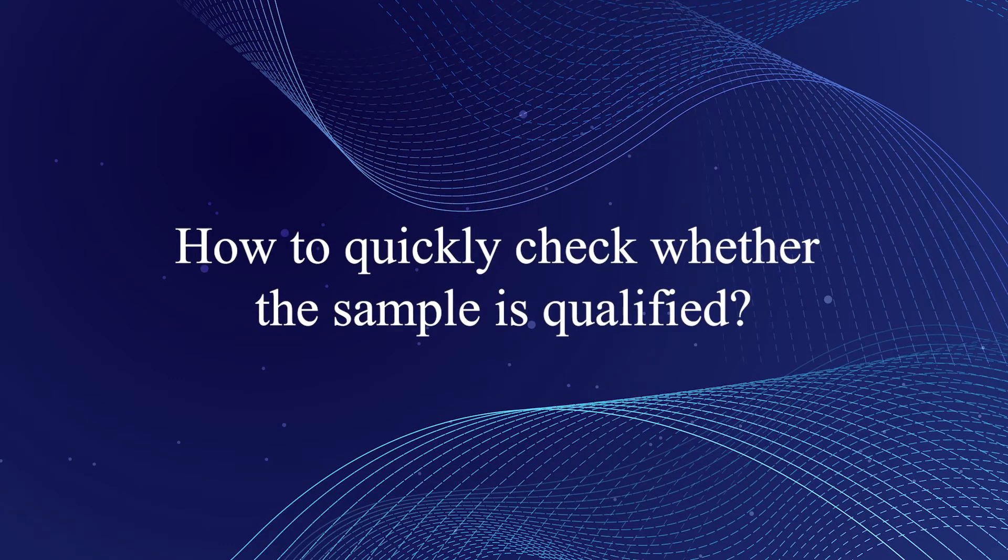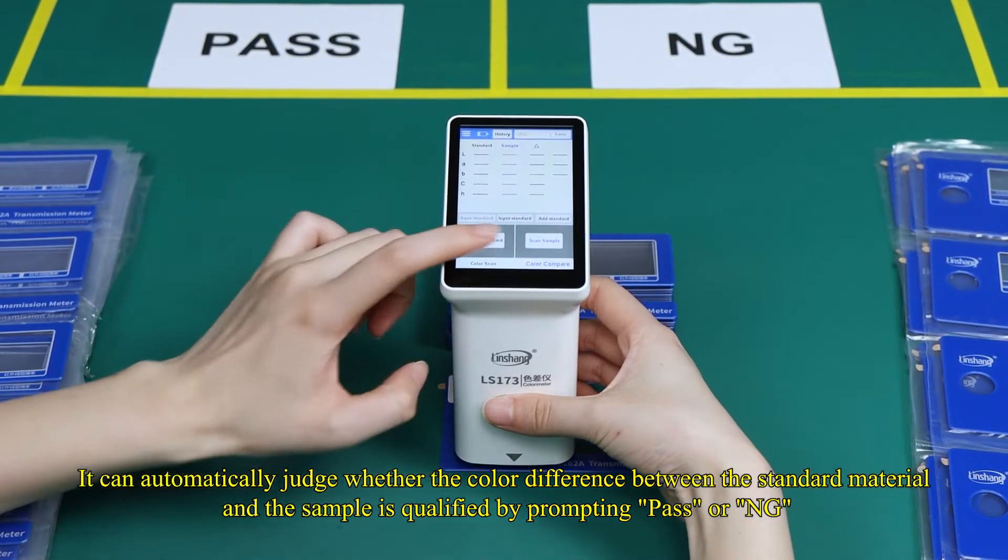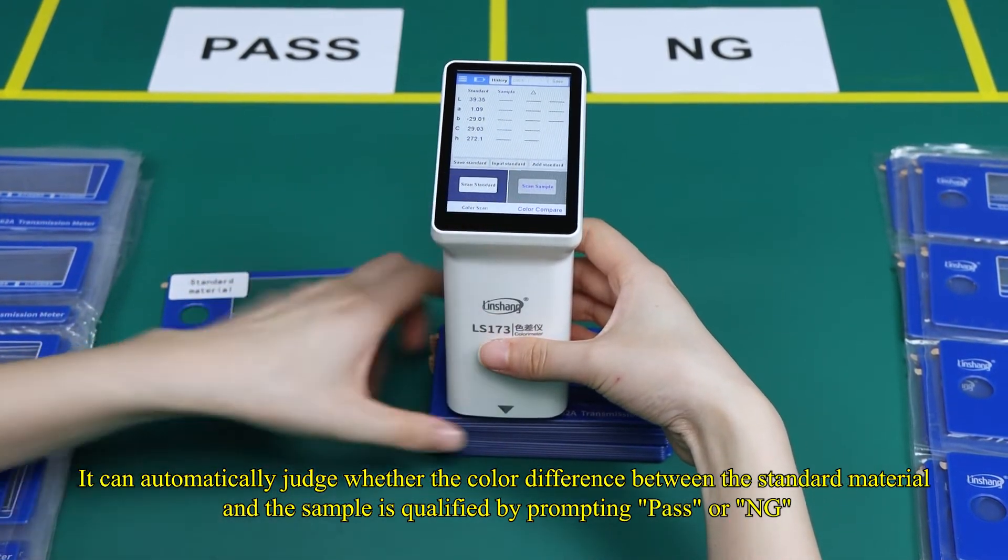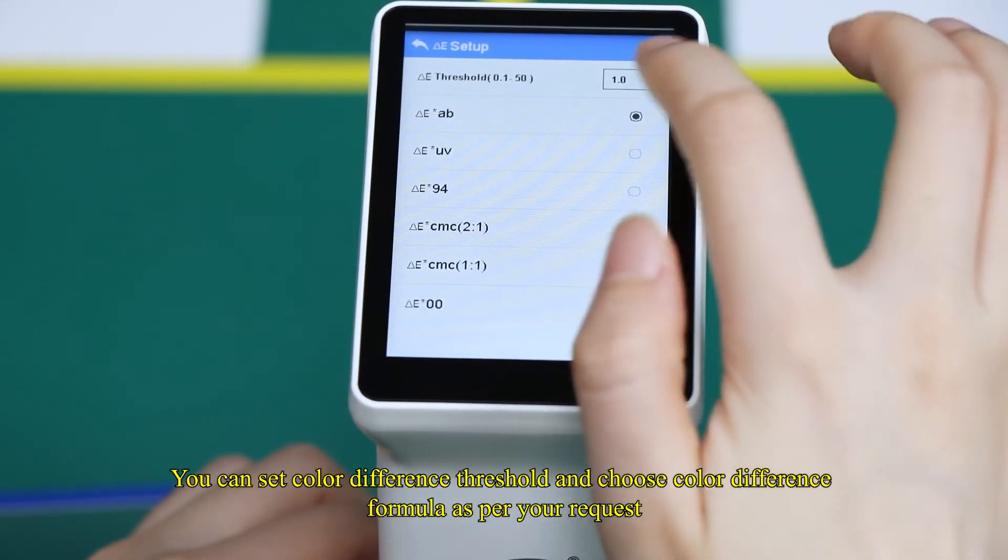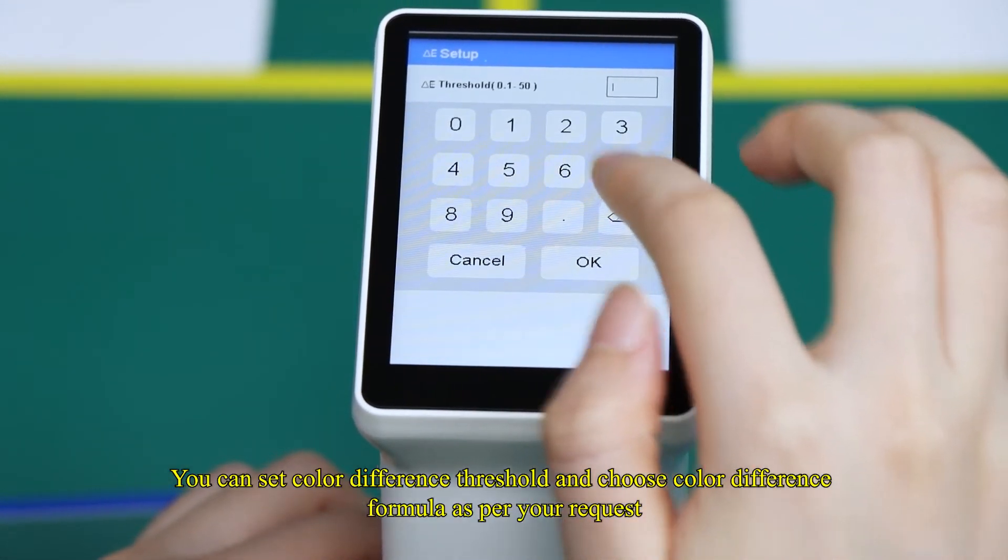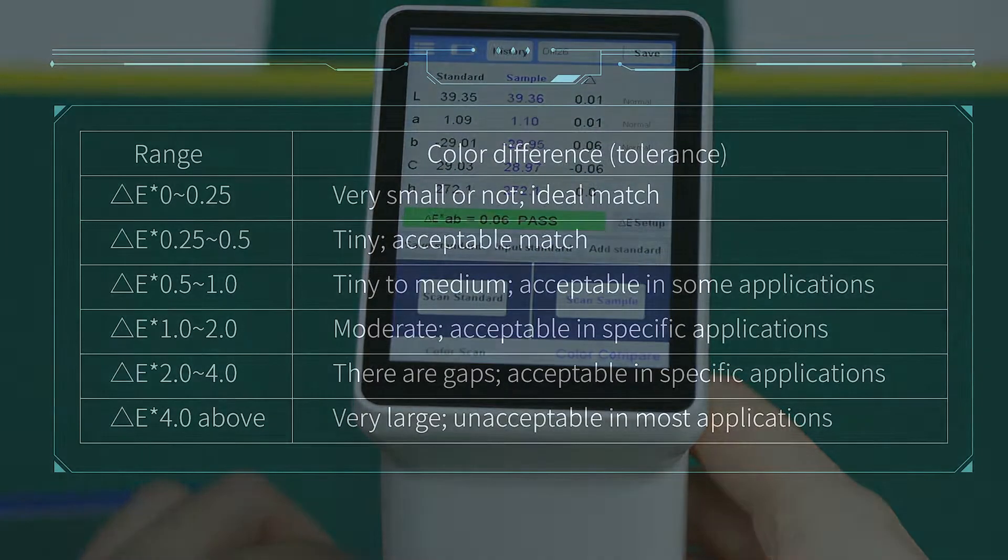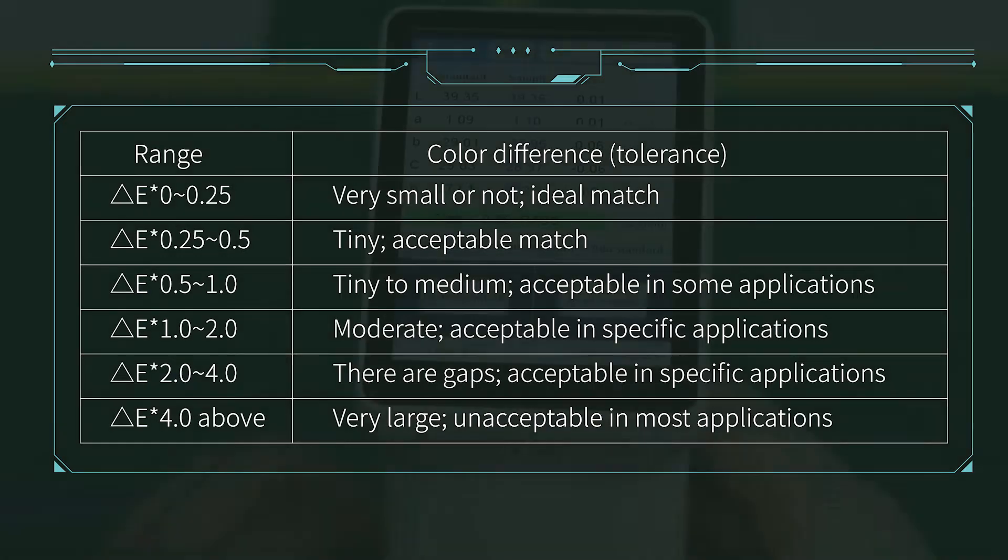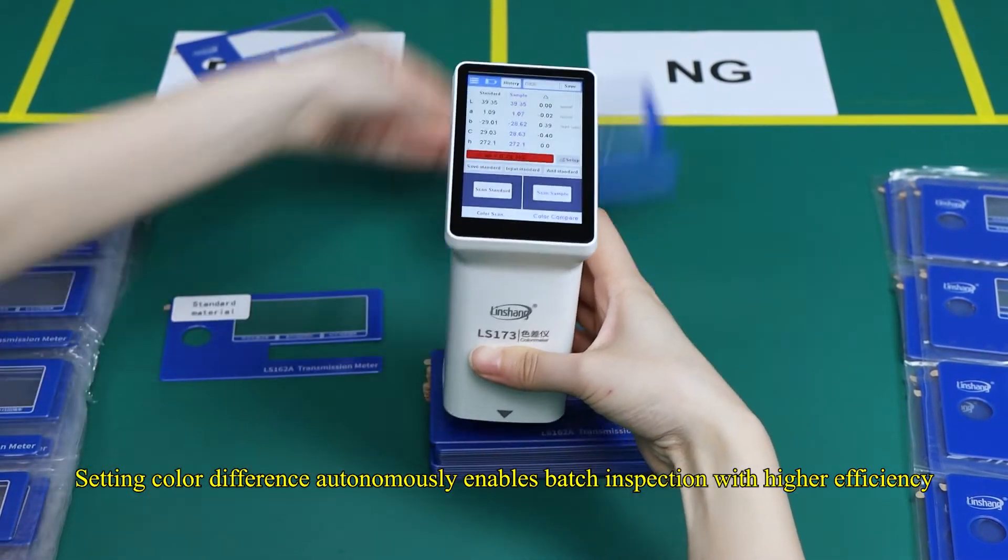How to quickly check whether the sample is qualified. It can automatically judge whether the color difference between the standard material and the sample is qualified by prompting PASS or NG. You can set color difference threshold and choose color difference formula as per your request. Setting color difference autonomously enables batch inspection with higher efficiency.